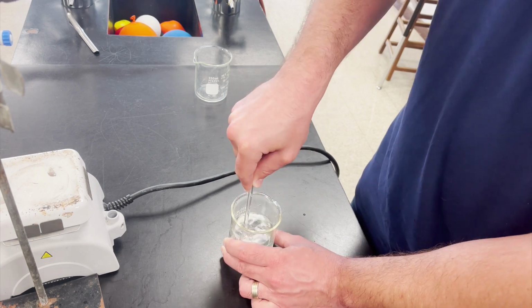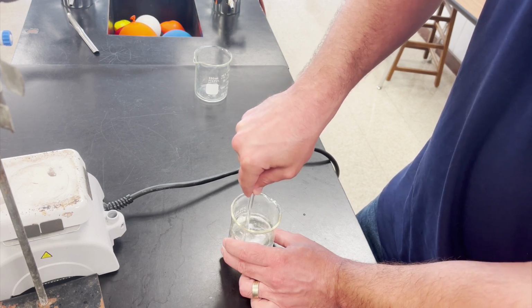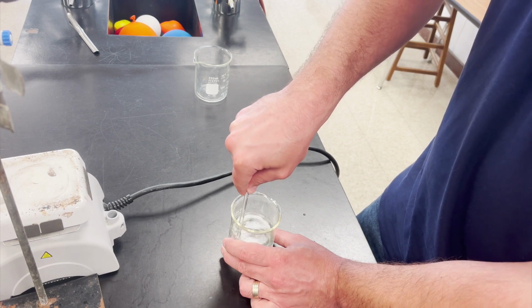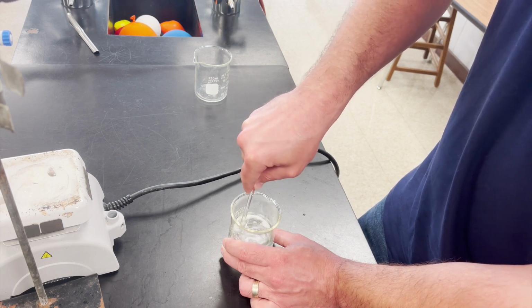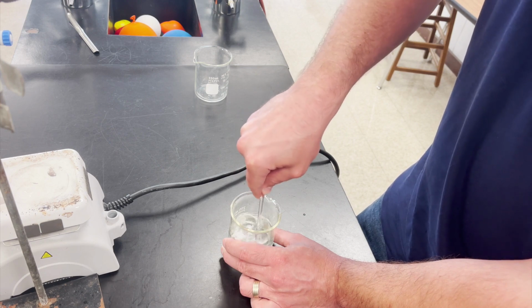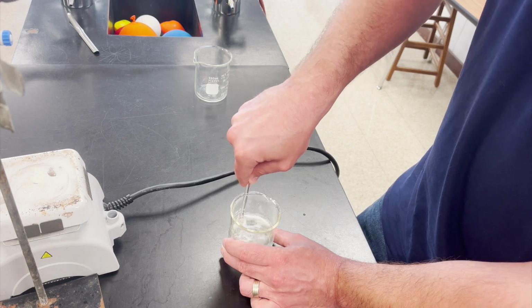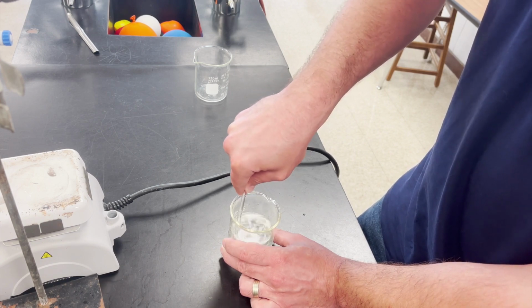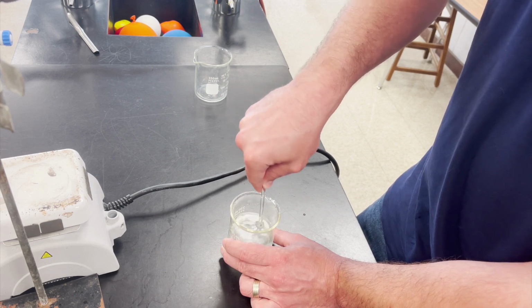Now, a tablet is not 100% medication. Really, a very small percent of it usually is actual medication, and most of the rest of it is filler that is not going to dissolve. So a lot of this white powder here won't actually dissolve because it's an insoluble filler.